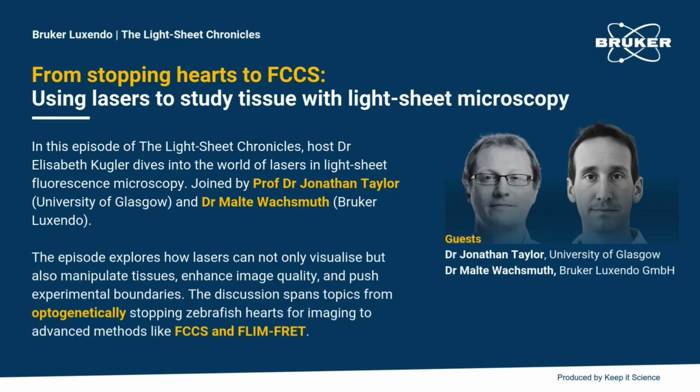So when you are interested in the interaction of two types of molecules that carry different spectral labels, then you speak more about a kind of dynamic co-localization of molecules. When these two little guys bind to each other, then they co-diffuse, and they create synchronized fluctuations in two spectral detection channels.